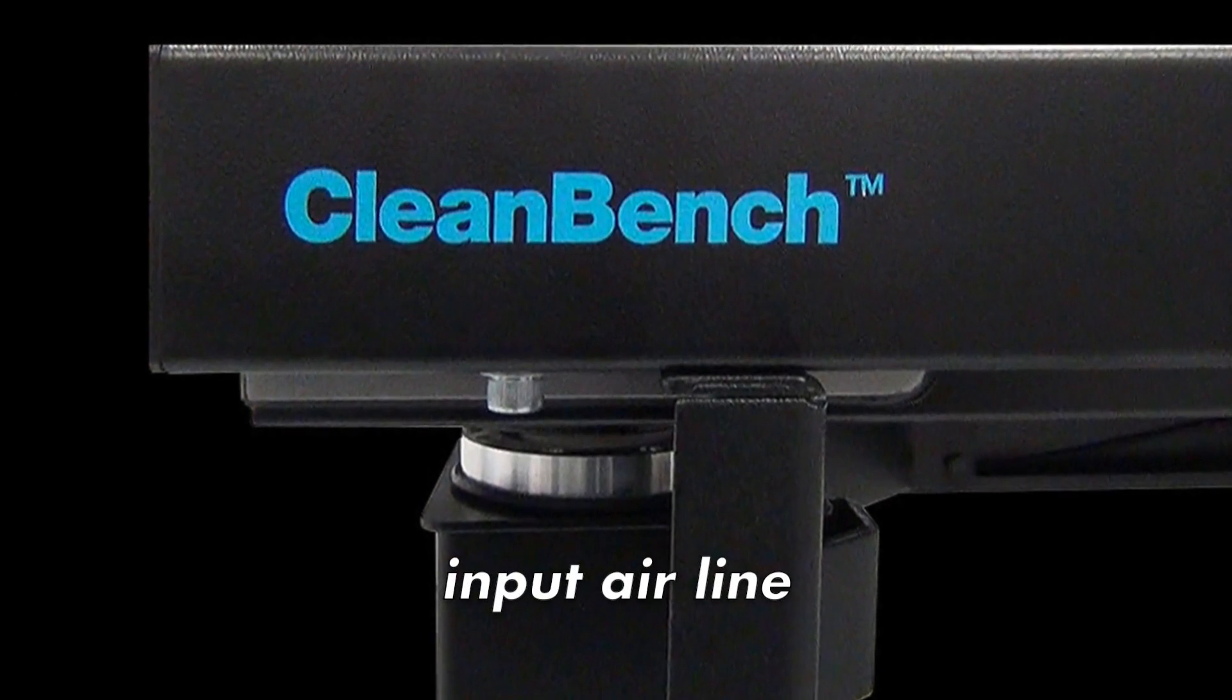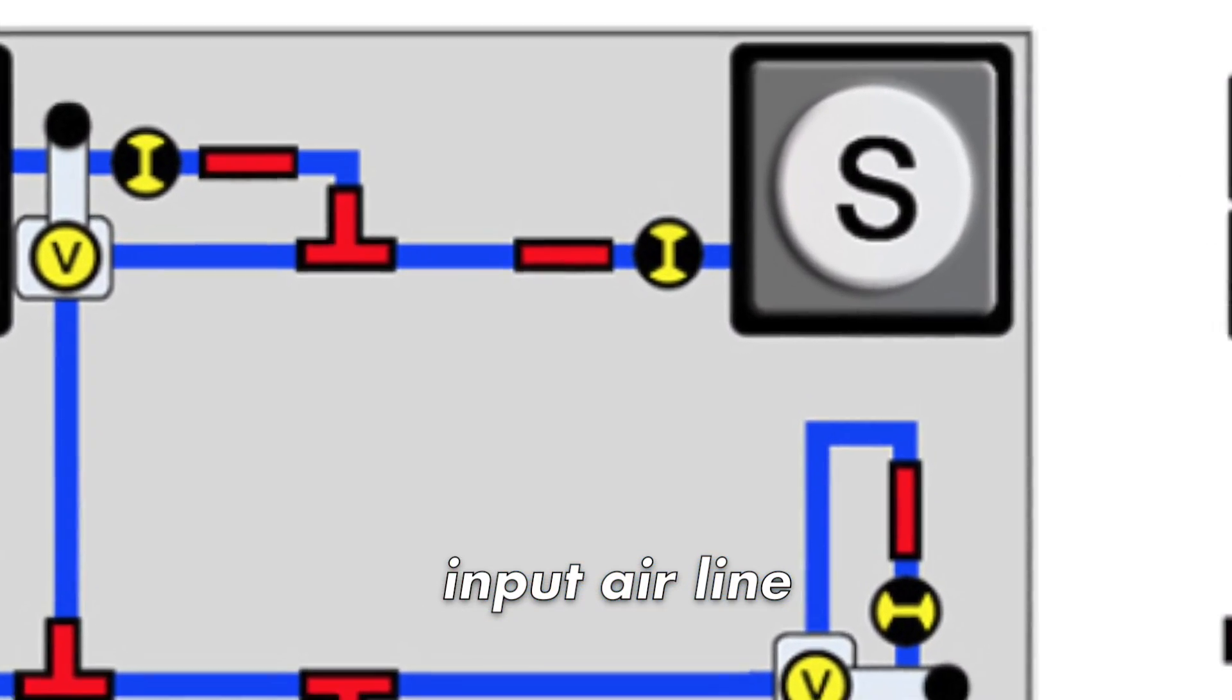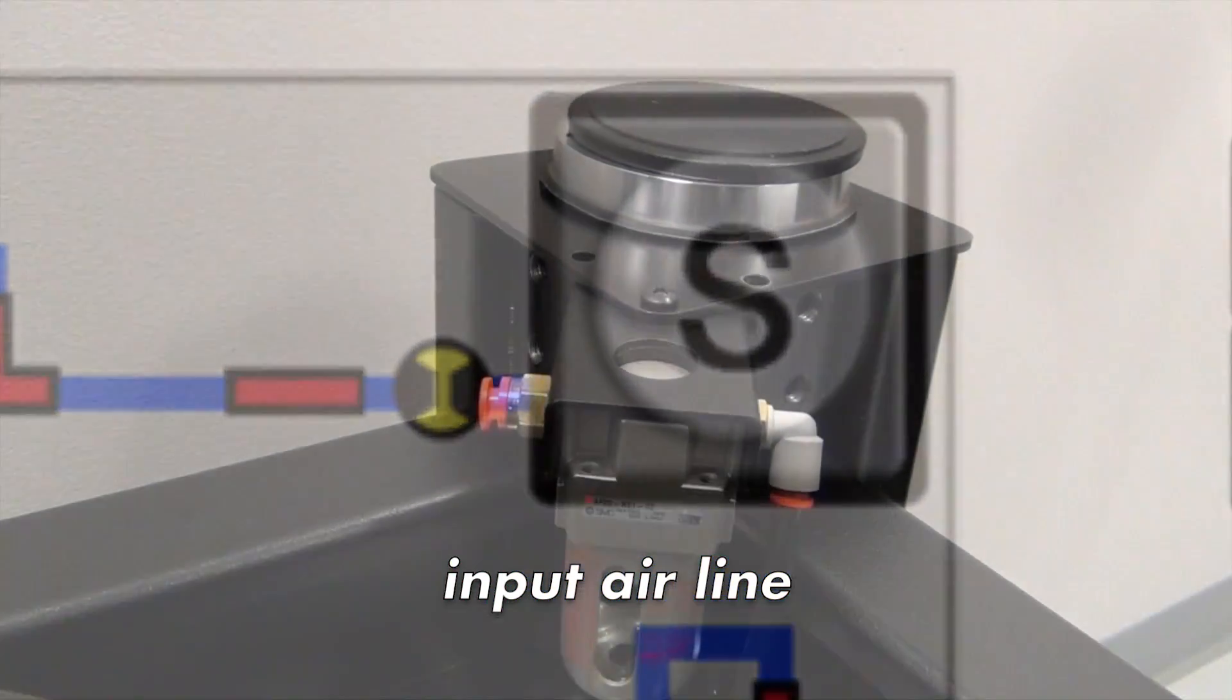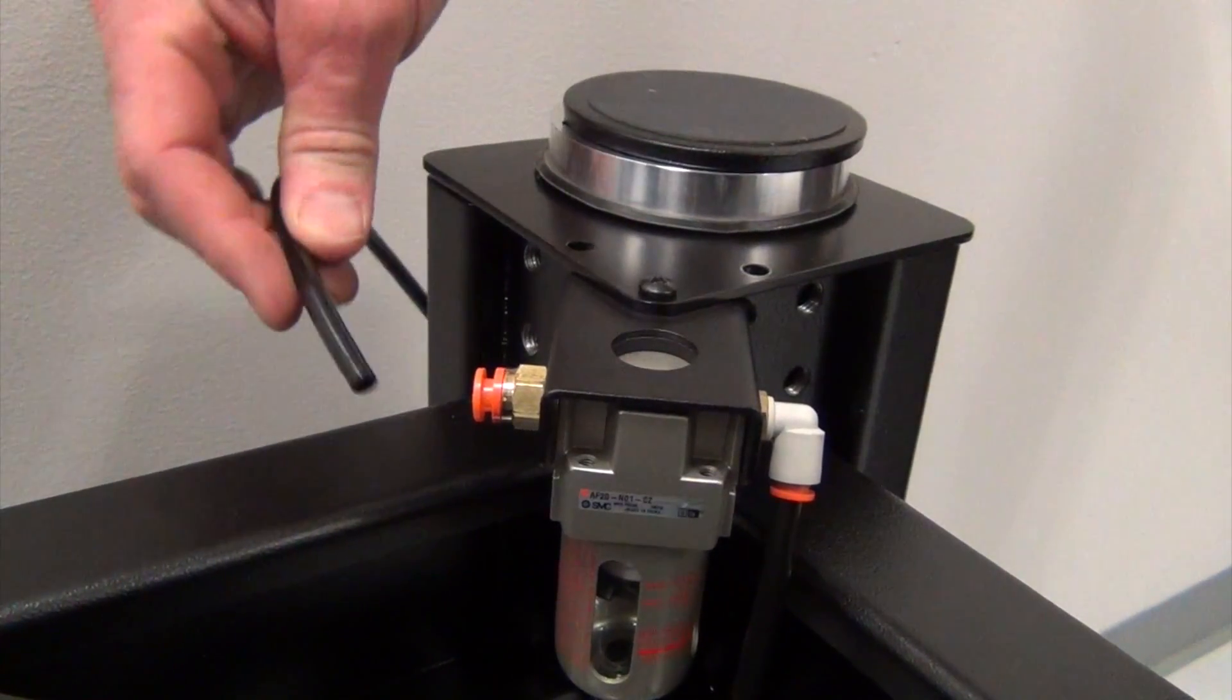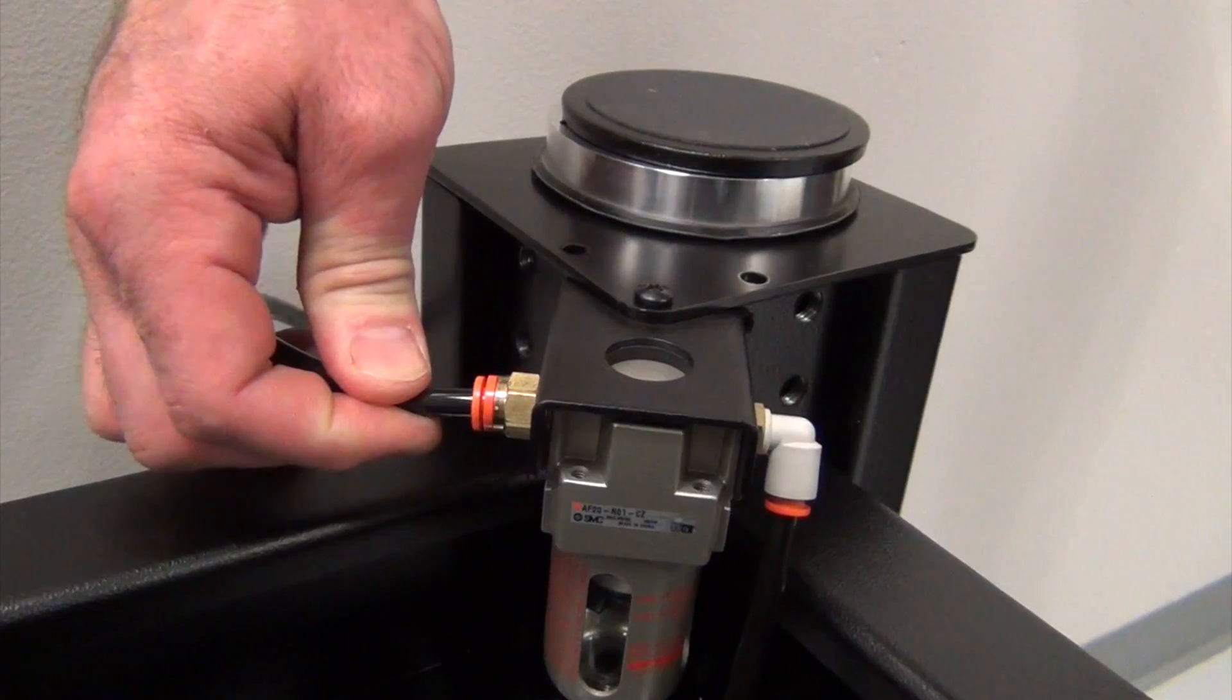The input air line can now be run to the press lock fitting on the filter located on the back right leg. To install the tubing into the fitting, press the tubing into the orange ring until it stops.